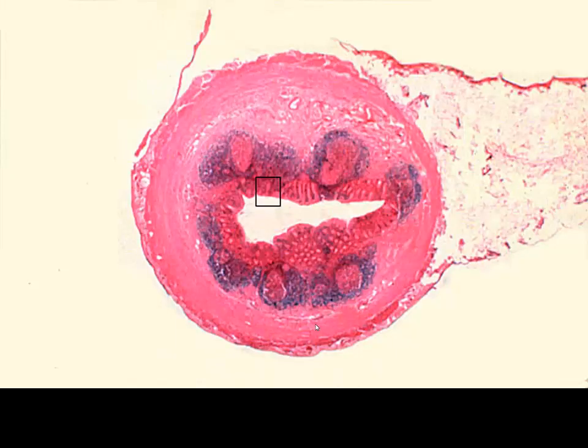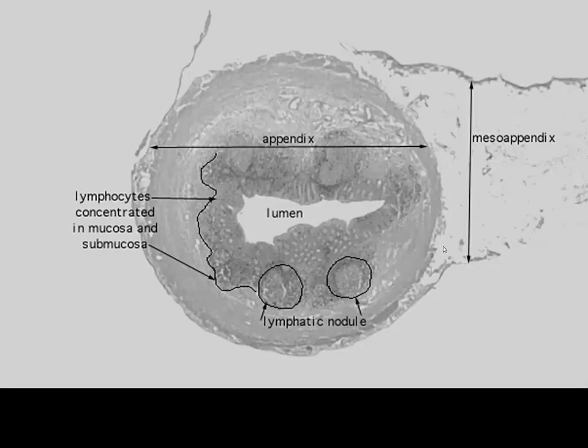Now here's another section through alimentary canal, and again we've got secondary lymph nodules, and in this particular instance we've got a much smaller luminal diameter, and often in this particular section we're going to have a lot of debris present in this lumen like we see in our tonsillar crypts, and this is going to be what it looks like in the appendix, the vermiform appendix. Again, we have secondary lymph nodules that are going to be permanent residents in this area with the appendix. And again, that's going to be another way that we can identify this histologically, our organ histology, in our alimentary canal.